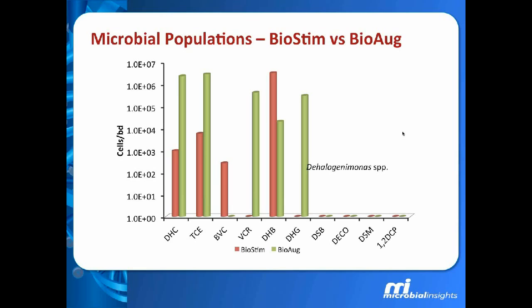Going back to the question about the BTEX stimulating the microorganisms, you said there was a several-fold increase in cell concentrations. Can you say with confidence that a 1 to 3 order of magnitude increase in gene count is from the addition of the electron, either donor or acceptor, and not from a natural variation?